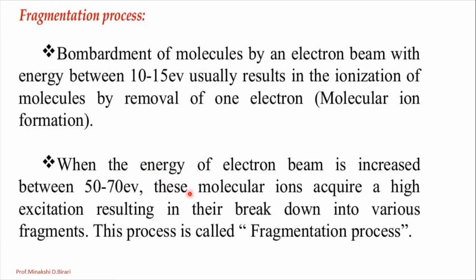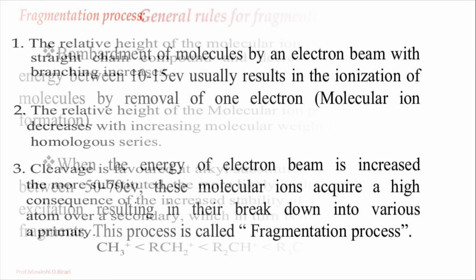The molecular radical ion will be converted into a number of fragments like M1 plus and M2. So this process is called the fragmentation process.